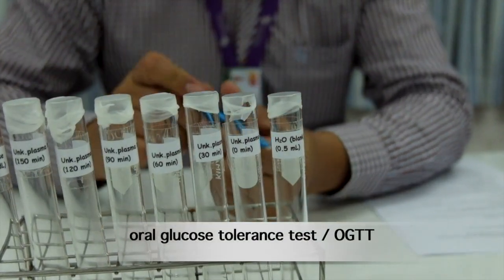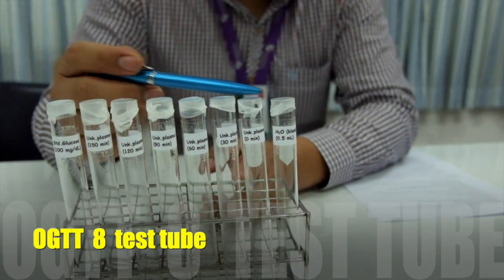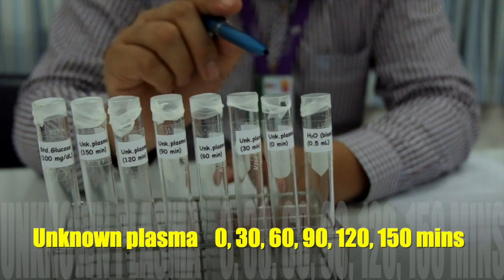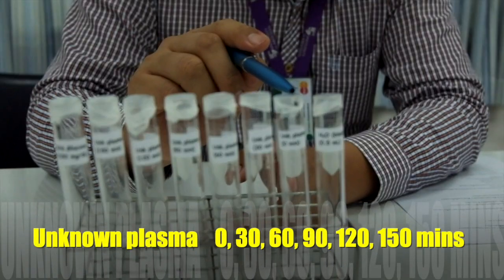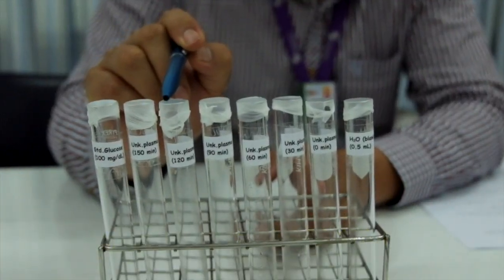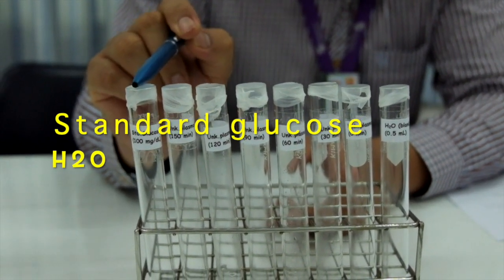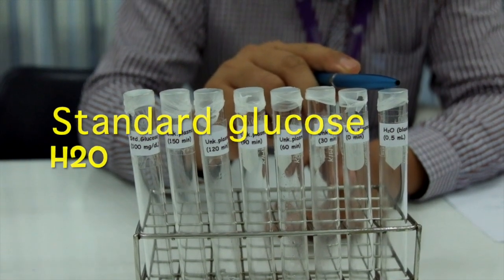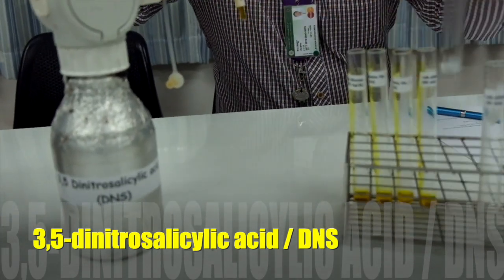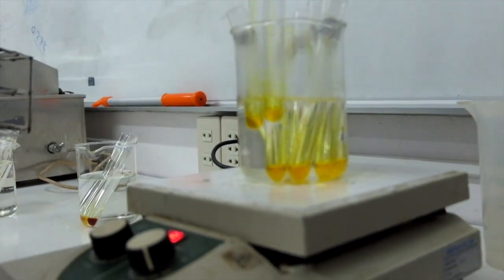Oral glucose tolerance test, or OGTT. To perform OGTT, you receive 8 test tubes containing 0.5 ml of unknown plasma collected at 0, 30, 60, 90, 120, 150 minutes after oral administration of glucose, standard glucose, and distilled water. Add 0.5 ml of 3,5-dinitrosalicylic acid, or DNS, into all test tubes. Mix well on palm. Boil all tubes for 5 minutes.